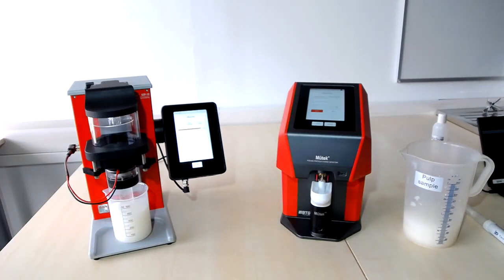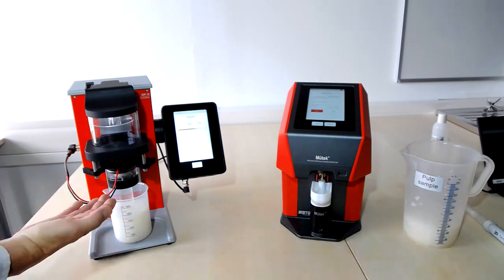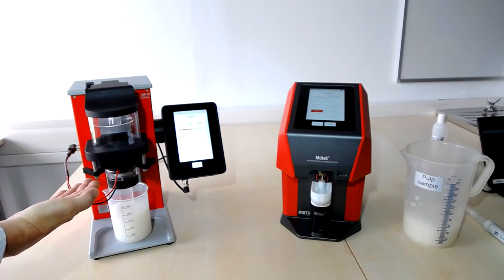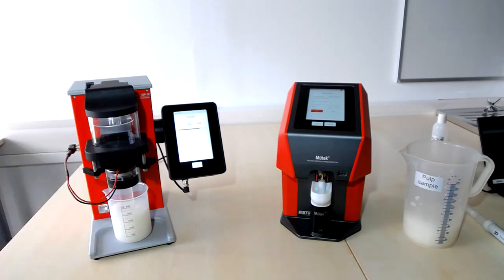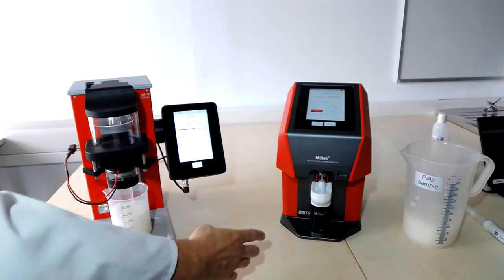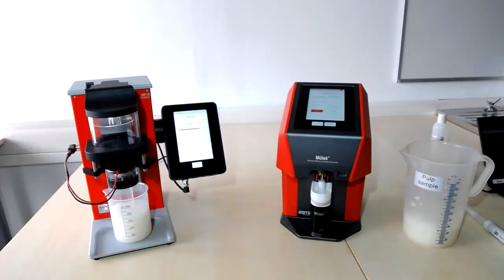And in a couple of seconds, the unit will start oscillating the vacuum between two values. And with this oscillating vacuum, there will be a tiny liquid flow up and down. Along with this tiny liquid flow, these counter ions gathered around the fibers will be replaced again, and we are creating a streaming potential. So vacuum up and down in the SZP, pretty much similar to piston up and down on the PCD.